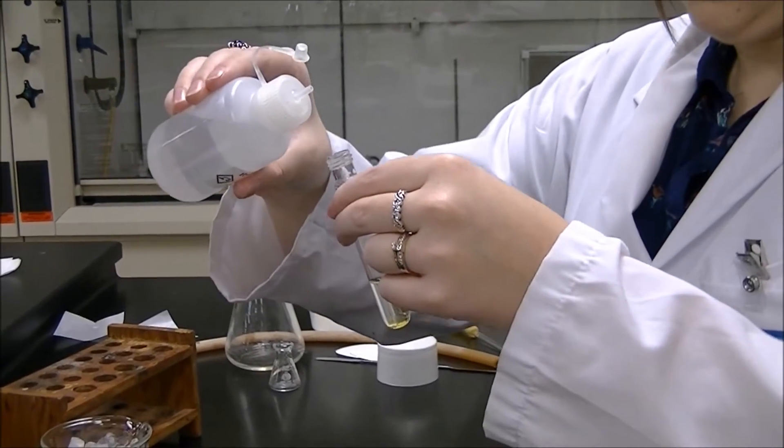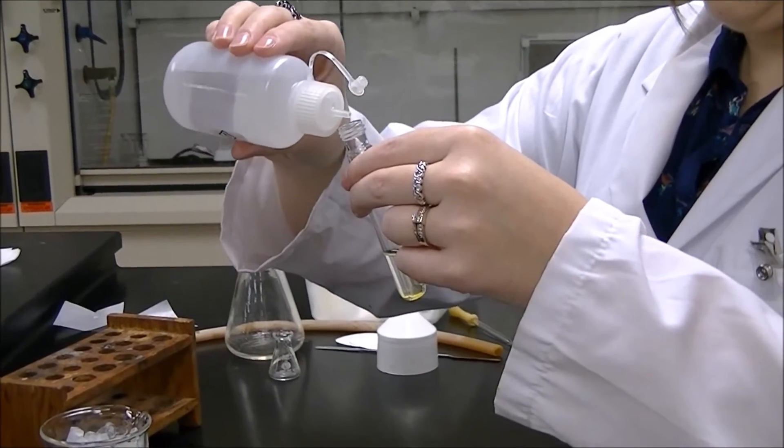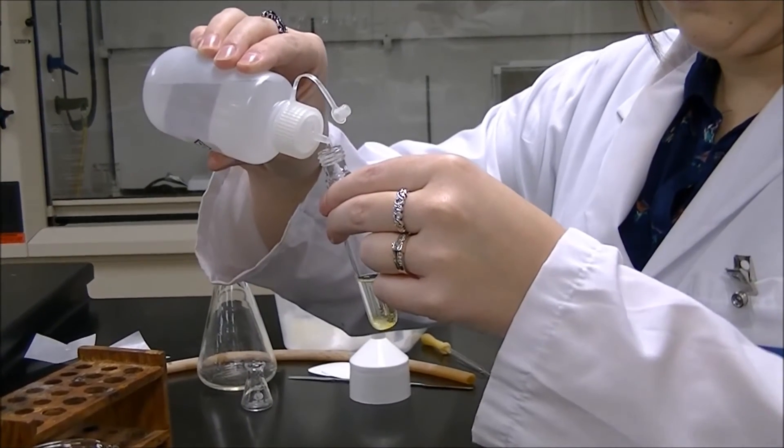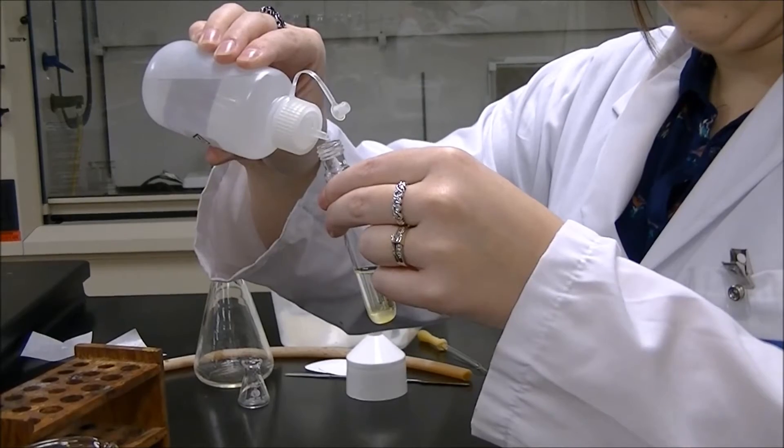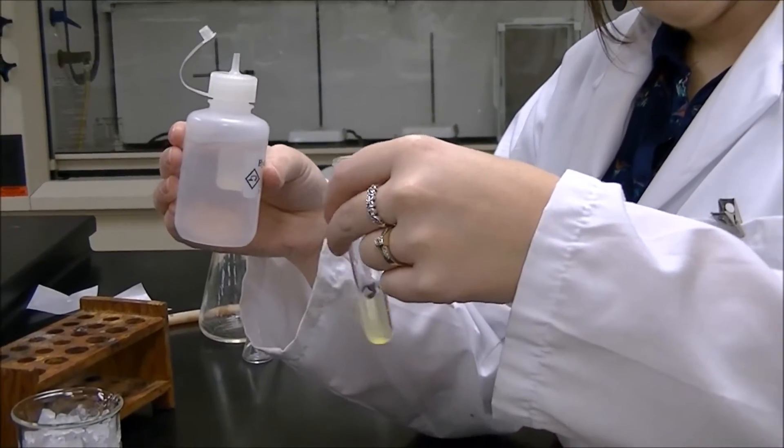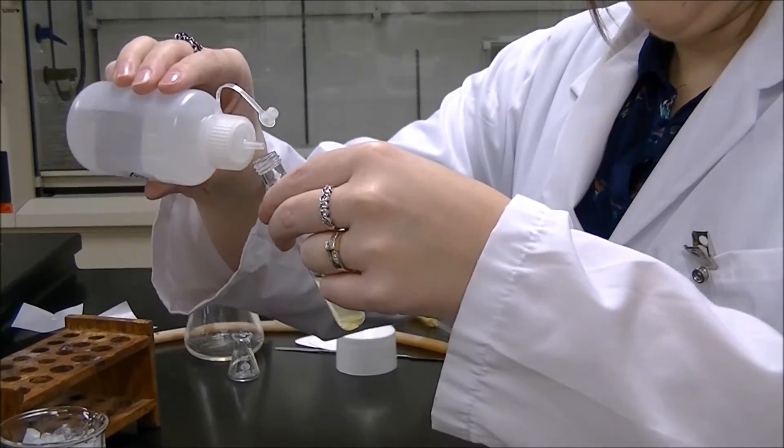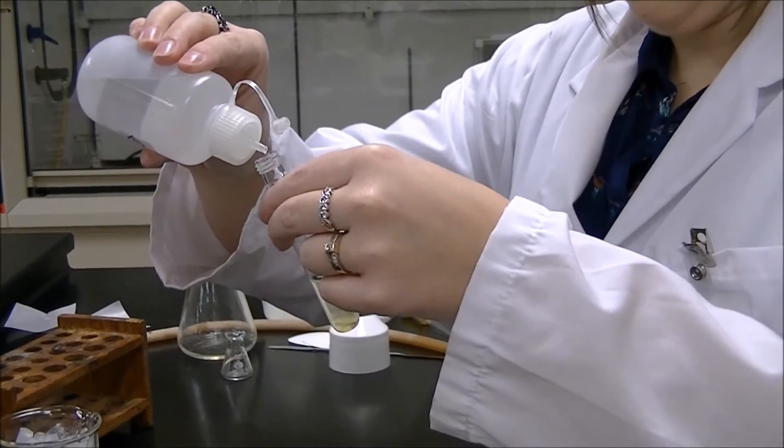Add about 2 milliliters of 3-molar HCl dropwise to the centrifuge tube while swirling. 2 milliliters of HCl is about two-thirds of an inch of solution. This will protonate our ethyl-4-aminobenzoate so it can make hydrogen bonds and dissolve into the aqueous layer.